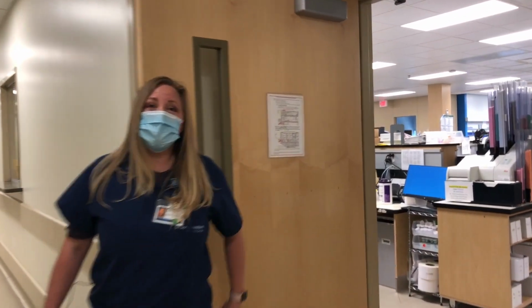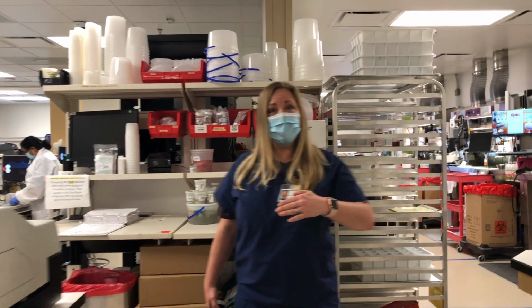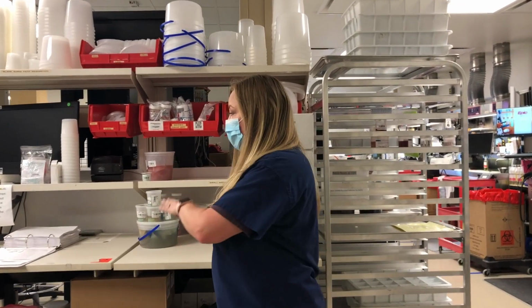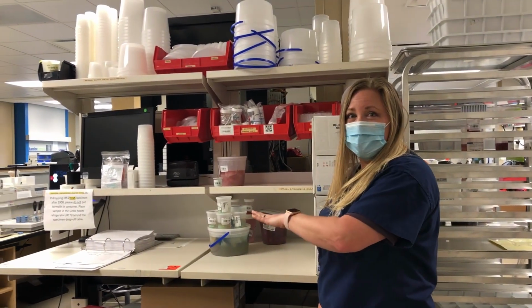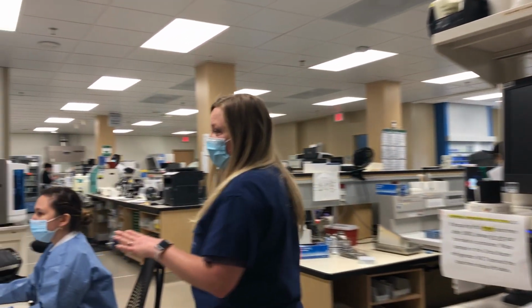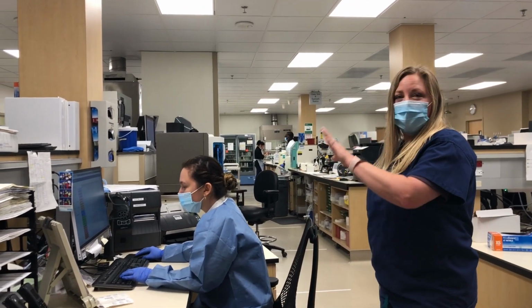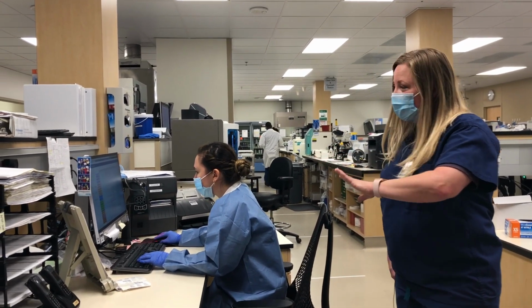As the specimen is coming up from the OR, it will come into this area where we will make sure to check it in our Epic system, get it logged in under the patient name, and make sure we get a number for it. We make sure that it gets all of the information that it's supposed to have, which we can check in real time: where it will go, what surgeon it was, all of that information is given.